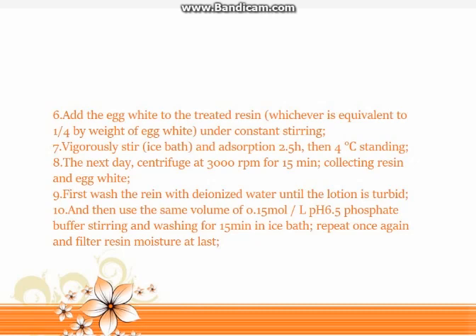Step 9: First wash the resin with deionized water until the wash solution is no longer turbid. Step 10: Then use the same volume of 0.15 mol/L phosphate buffer at pH 6.5, stirring and washing for 15 minutes in an ice bath. Repeat once more, then filter to remove resin moisture.